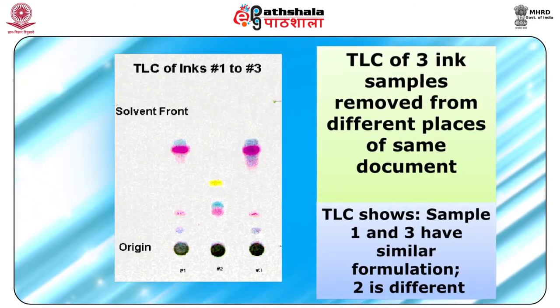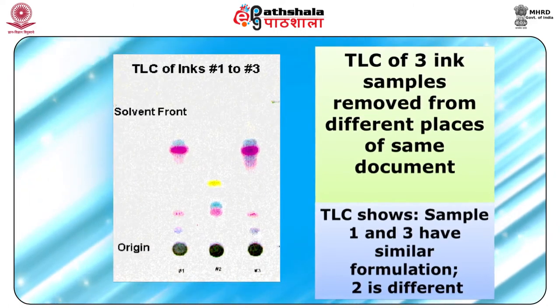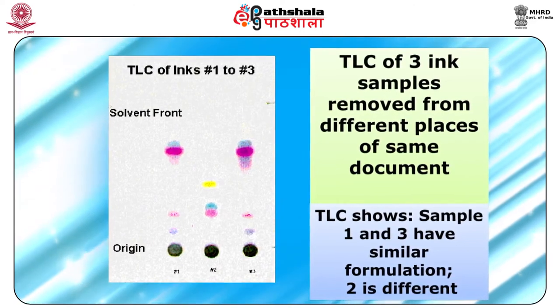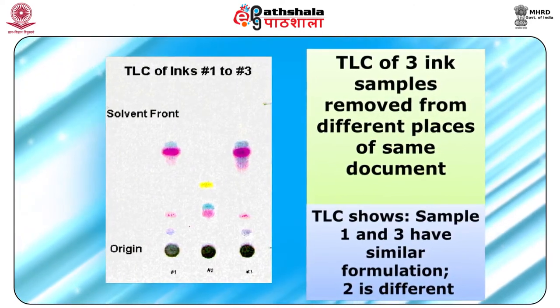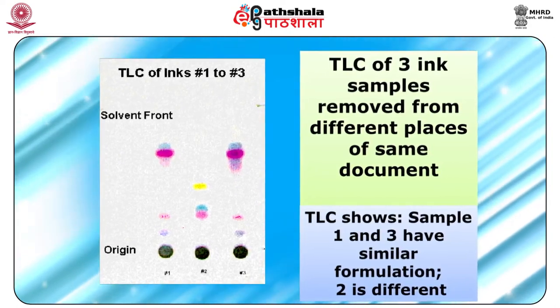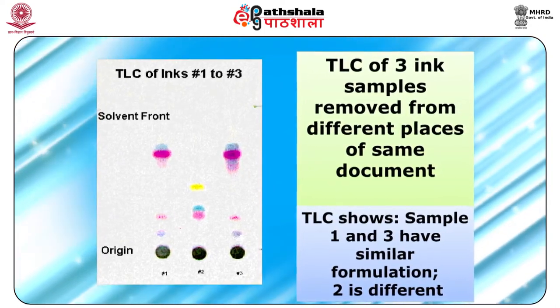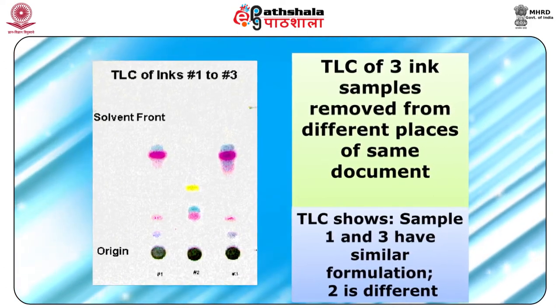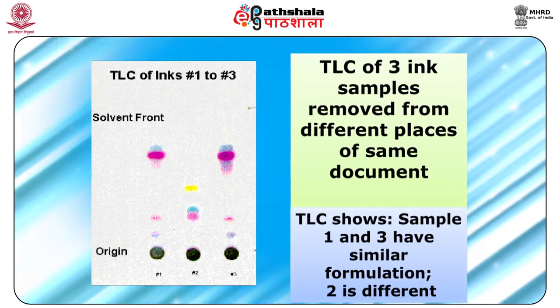Now here is a picture that represents the band patterns corresponding to ink removed from three different areas of a document. The figure shows that samples 1 and 3 have a similar formulation, while ink 2 contains different components than the other two.